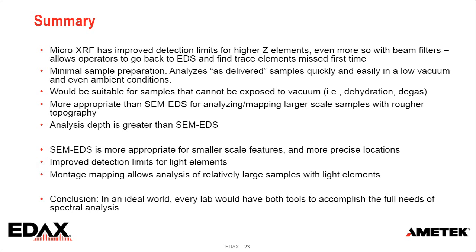The beryllium has much lower X-ray transmissivity in the low energy range. Also, for micro-XRF, the excitation efficiency is better at higher energies due to the more efficient emission of the X-ray tube at the higher energies.